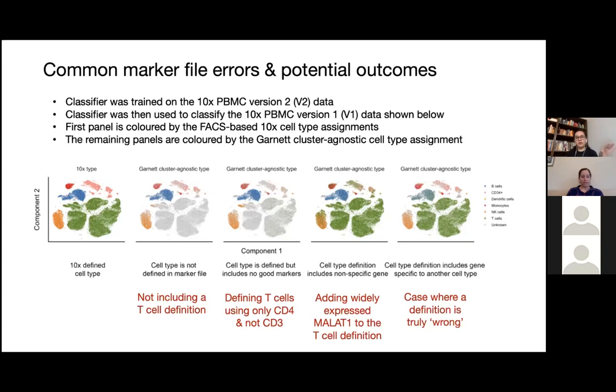It's either going to be an unknown group, which is completely grayed out, or it's going to be a group that has all of the cell types in it. So it's a very colorful cluster, but it means nothing. You'd want to go back and remove the widely expressed gene. You want genes that are specifically expressed in particular clusters to be confident that they're good markers.